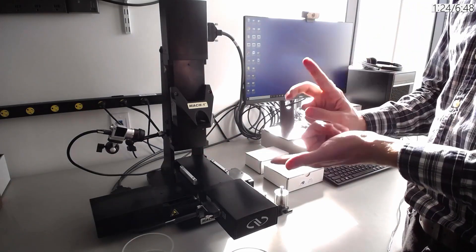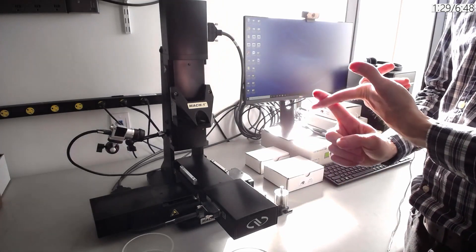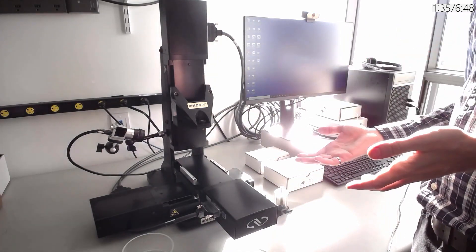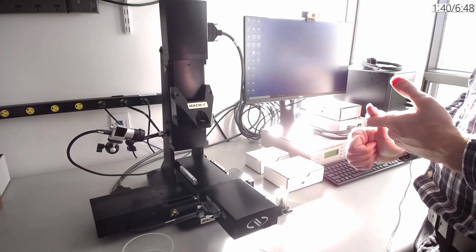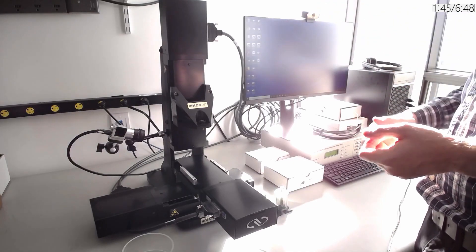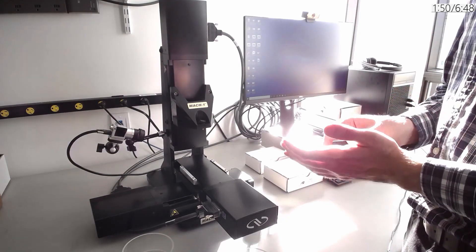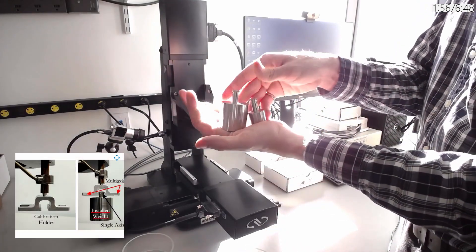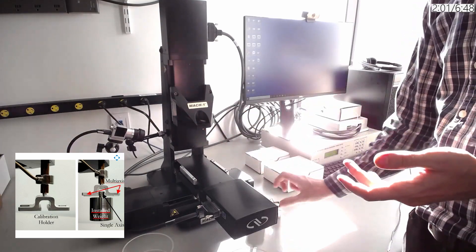This allows for one test with one setup to test both the modulus in compression, the modulus in shear, and then to do a friction test afterwards as well. Each system, even the base model, is turnkey so that we can get you started testing your samples on day one during the installation, and we always add a webcam and headsets so that you can do troubleshooting anytime by contacting us. Each system comes with a calibration weight holder and different calibration weights. This allows the user to check whenever they want if their load cell is still within calibration, avoiding the yearly maintenance that is usually associated with load cells.